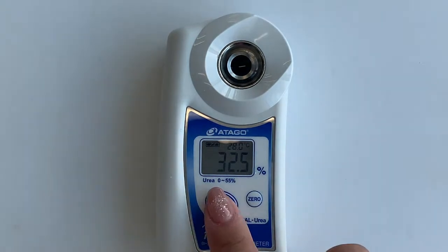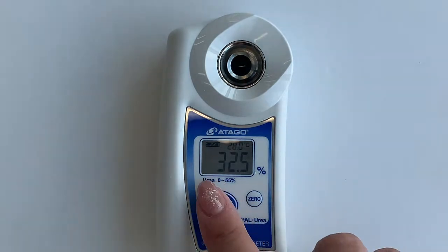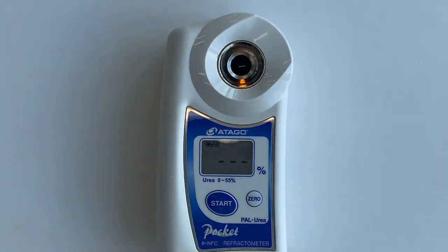The first measurement is 32.5. The second one is 32.5. And the third one is 32.52.